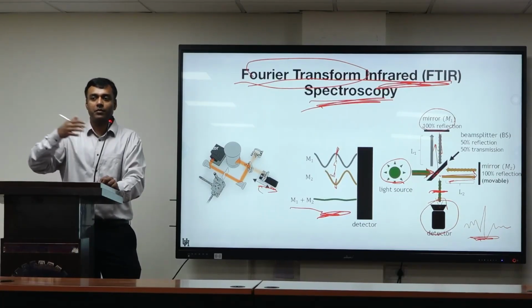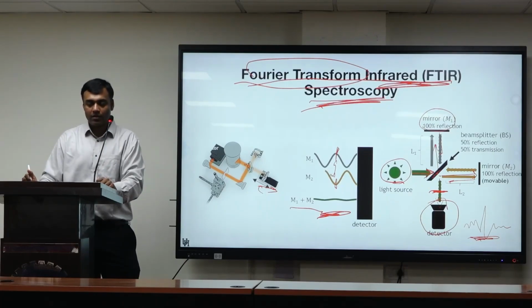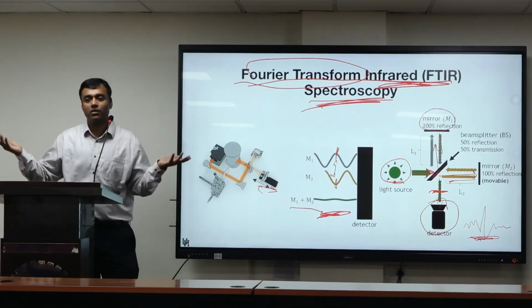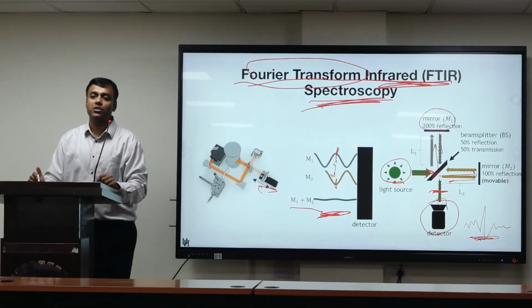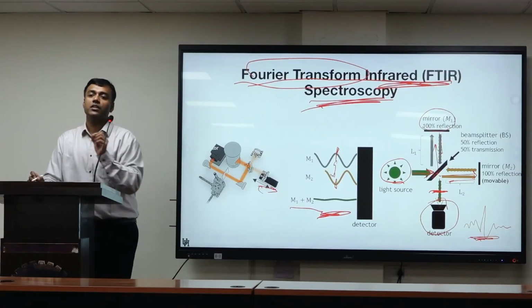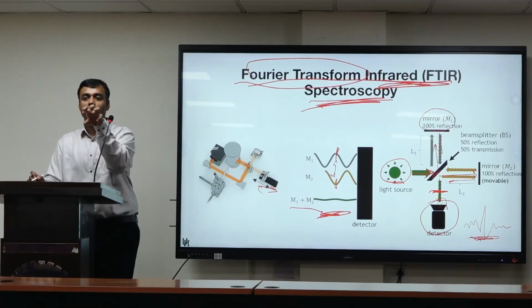For one chemical, for one location, you can get a spectrum of this sort. Then the next question is, if you have one chemical, like a liquid or powder, it's easy to make a measurement, because it's a homogeneous thing. It's not varying from place to place. But if you have tissue or some biological sample, from one position to the next there is a big variation in the spectrum, because the chemical composition at every position is different.